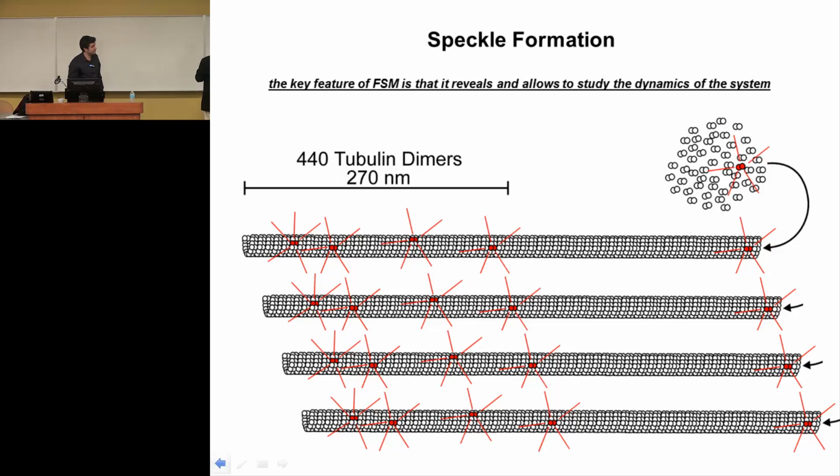When I watch this movie, from my point of view, I think the detection itself is a harder problem, because these points are so small. What you are detecting is with the simple approach of difference of Gaussian and so on.